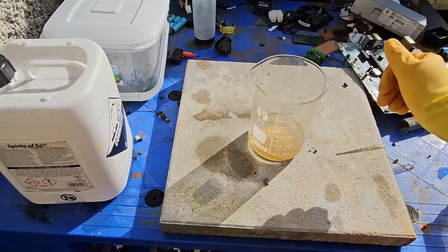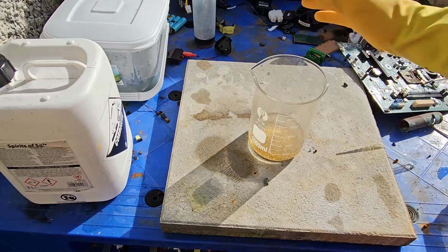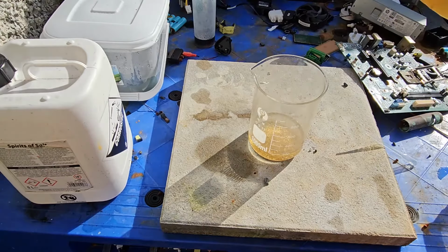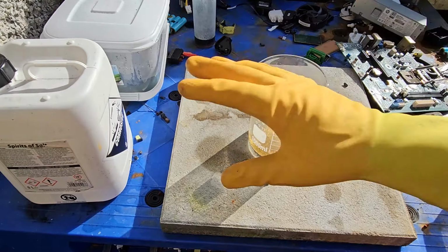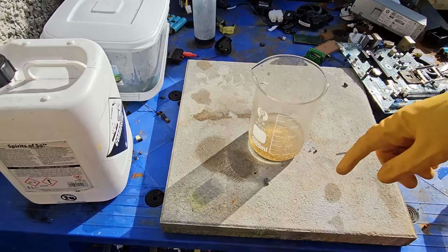I'll cover the top and we'll let it work away, and again, stay away from it. Don't be putting your head in over the fumes. Do it outside, do it under a fume hood. Wear proper protective gear. So again, I have the gloves on when I'm doing this, and I'll let that work away, and I'll add more bleach.